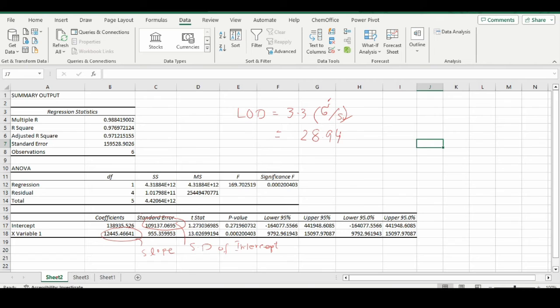This is the limit of detection for ICP-MS in counts per second—the minimum that can be detected using that ICP-MS instrument.